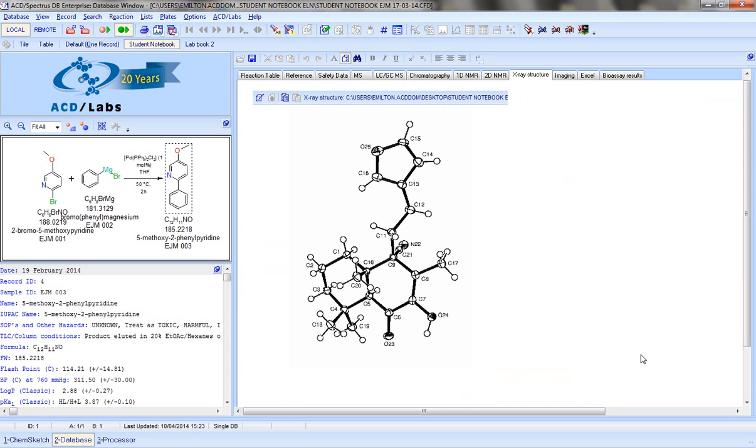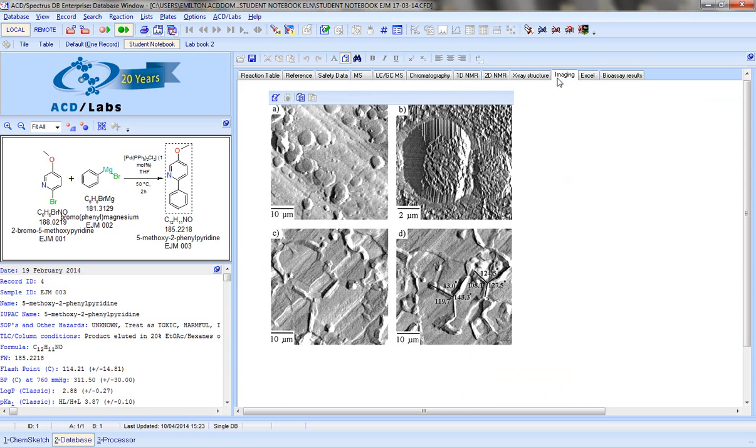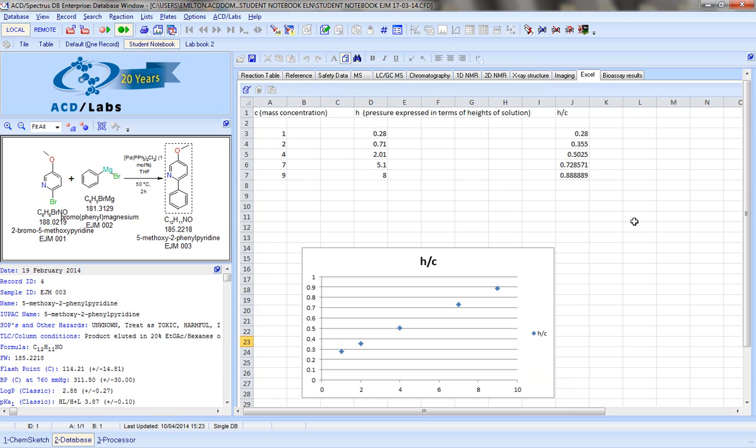We can associate X-ray structure data, imaging files, and we can also embed Excel files which allows you to easily tabulate and represent your data in graphical format.